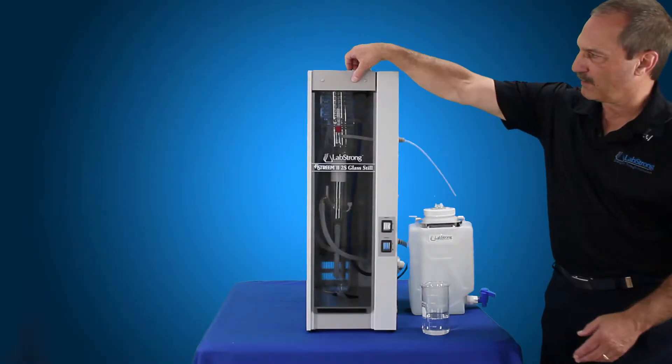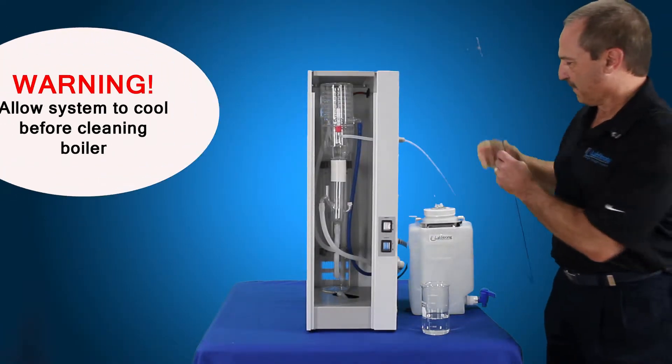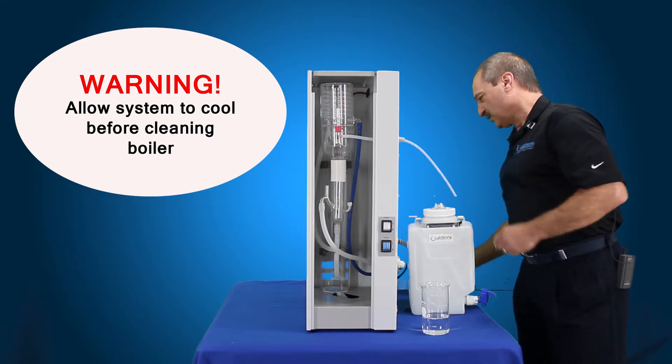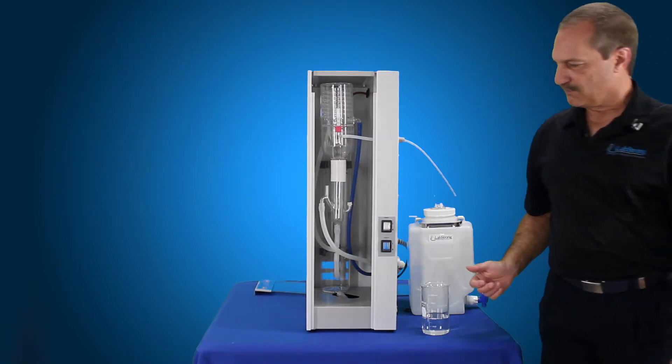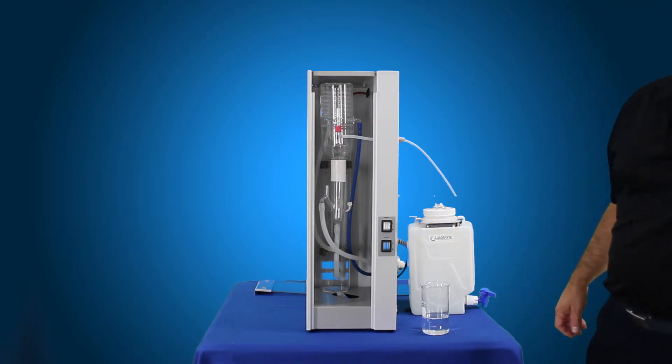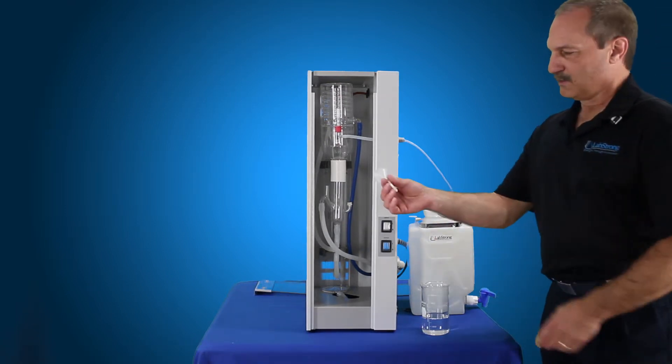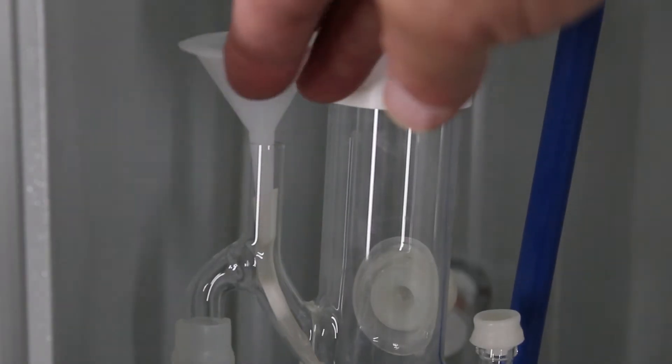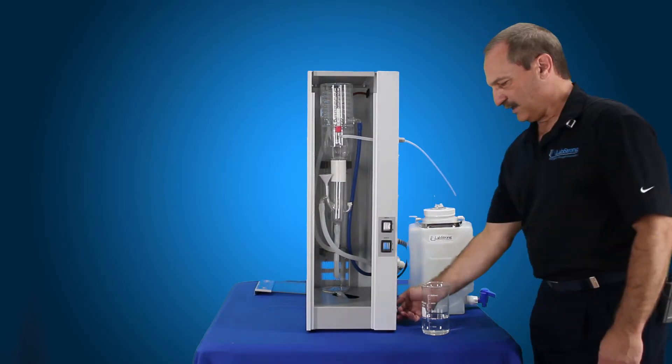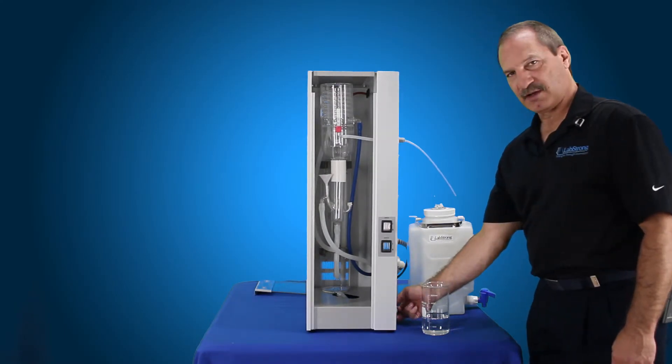We're going to go ahead and remove our cover. Each Fi-Streem II 2S still will come with a funnel, and the funnel is placed in the vent tube of the constant level device. Just put that down inside of there so that's going to go into the boiler. Again, that's why you want to make sure that your drain valve is closed.